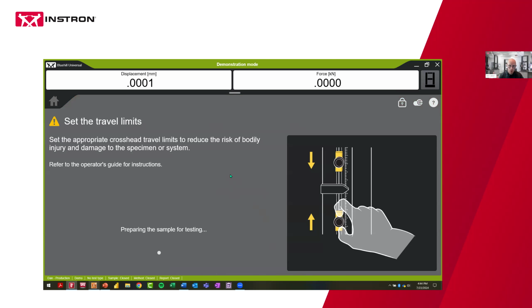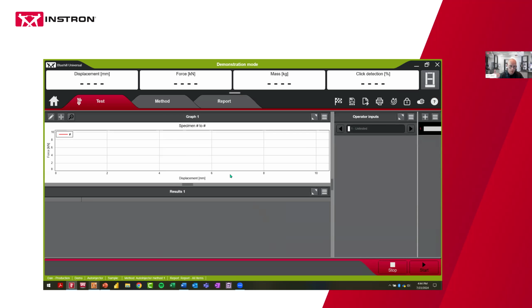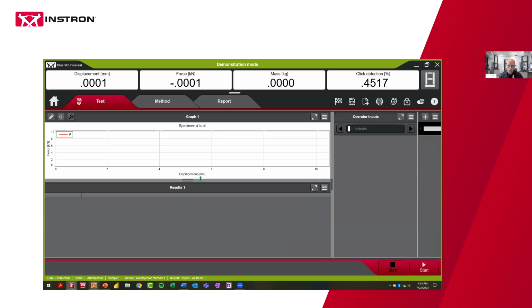If you had multiple tests that you needed to do, you would open up the next system suitability to check the scale next. Maybe the first one is the load cell, the second one is the scale, the third one is the camera that's measuring the needle length, and you could have any number configured. And then once you've passed all of them, you could proceed like I just did, and now they're off and running for the day.